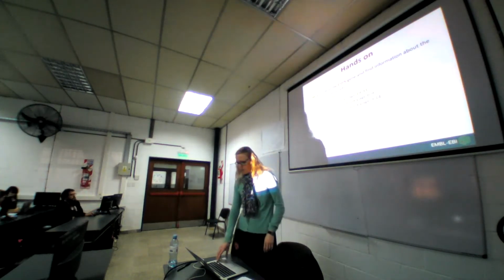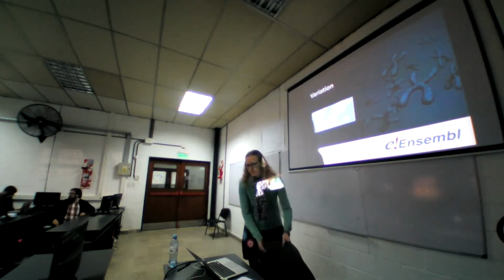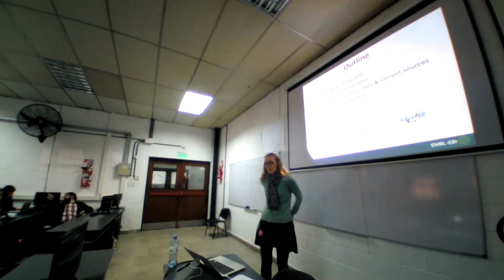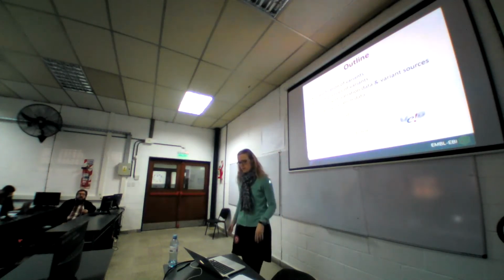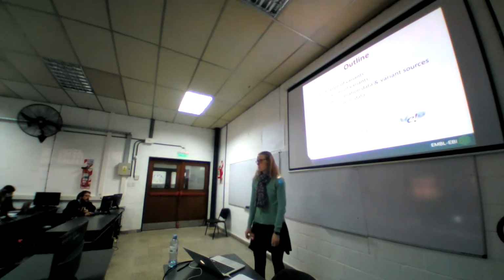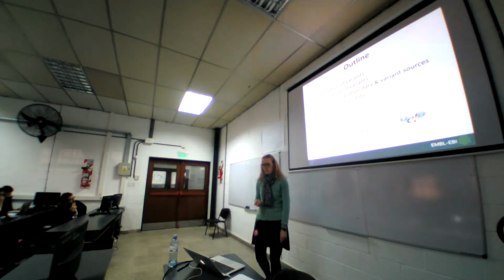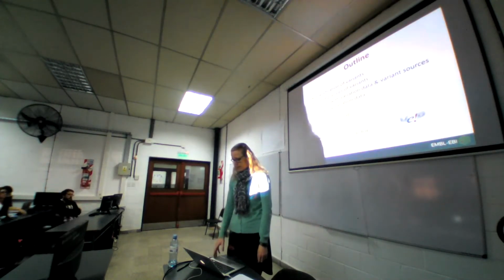We will then move on to variation now. I will start with the presentation again. So I will introduce our system, how we classify variants and their consequences. I will talk you through the species for which we have variation data and where that data comes from. We will then browse that data in different hubs, and after lunch also use the variant effect predictor, or in short, VEP.